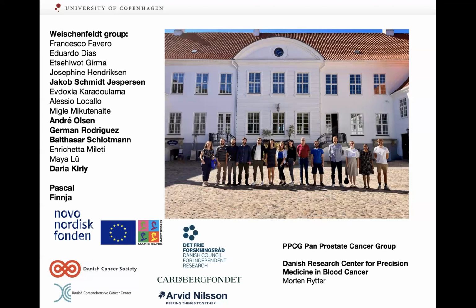Yeah, absolutely. And I think that's why we're quite far from the germline benchmark data, because many of these are indeed subclonal, and I guess for Illumina sequencing, we know quite well what our sensitivity is. We just don't know for long read sequencing. That's also why it's an exciting field, right? Because it's so fastly evolving, and there's always a new update if you check. So that's exciting, but it also means that it is a moving target. But definitely low subclonal events are a huge issue also with 30x, because it's a numbers game.